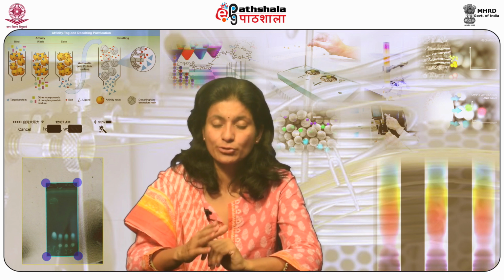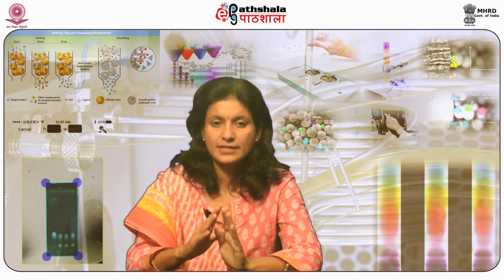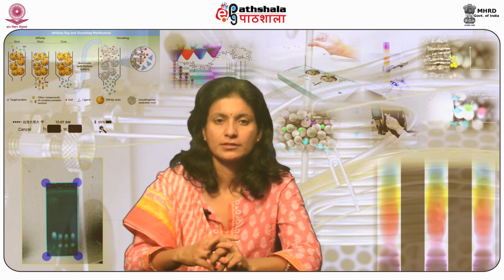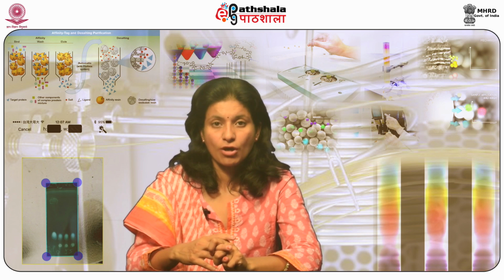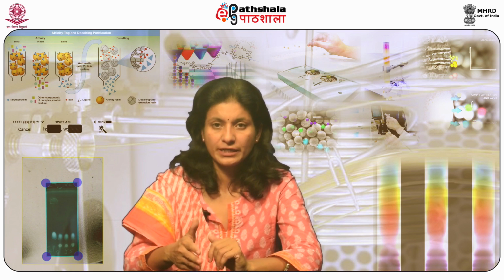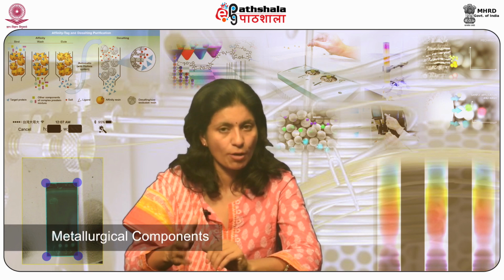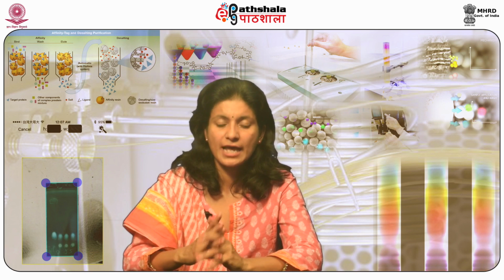IEC is an accurate analytical technique for solving many disastrous problems like production of semiconductors, determination of heavy metals in cement, determination of petrochemicals, for example, amines, mineral acids, cyanides, etc., analysis of metallurgical components, for example, steel and alloys.